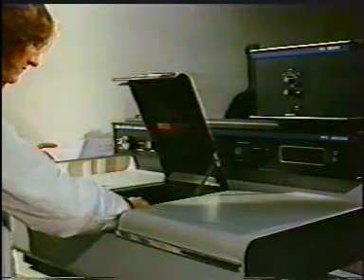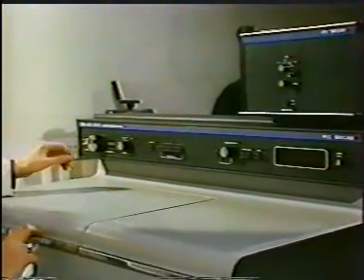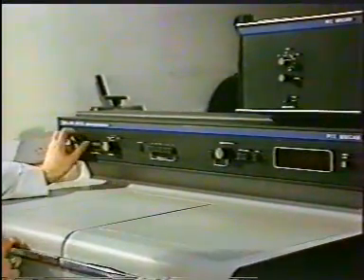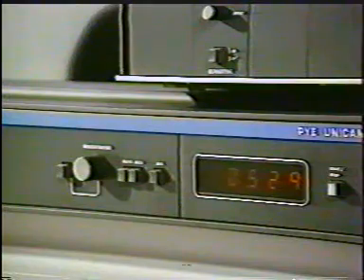This sample of chlorhexidine solution is being assayed by measuring the absorbance of ultraviolet light. The absorbance reading is above the upper limit of 0.497, indicating that the solution is too strong. Here is another example of chlorhexidine preparation that is coloured red, and some of the dye has precipitated.